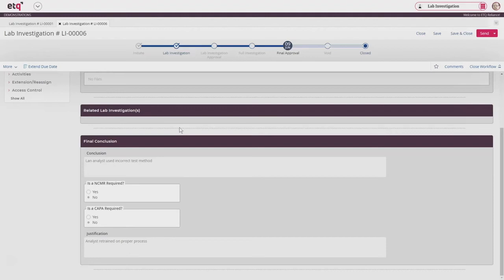rather than some sort of unknown error that we have to go through a manufacturing investigation checklist to determine what the actual issue is. So both scenarios are, of course, important. You want to collect those out-of-spec or out-of-trend lab results that either go through the full investigation process, or perhaps you determine early on in the process that it was, yes, a lab error, and you still need to collect that information and be able to report on that information, because both are very important.